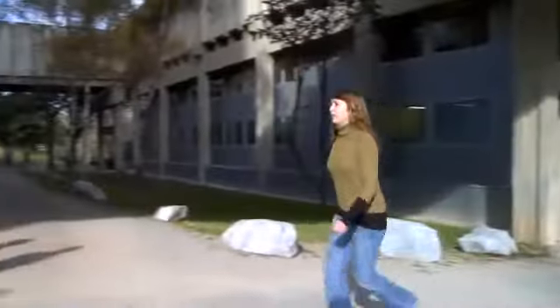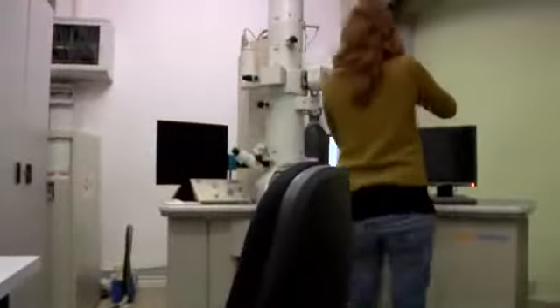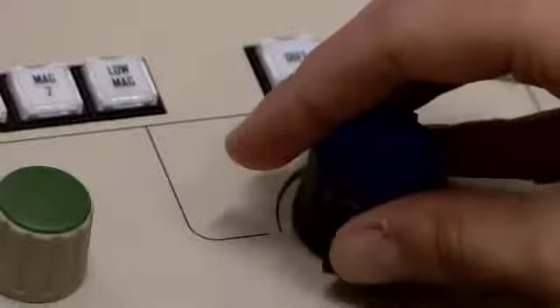Let's see if Elena's work with single ferritin molecules is just as successful. What we have to do is to get this substrate and go to the transmission electron microscope. And if you focus on each one of these spots, you can really count how many ferritins you are writing on each one of these spots. She can clearly see the ring from the evaporated printing solution and also the individual ferritin molecules within each ring.